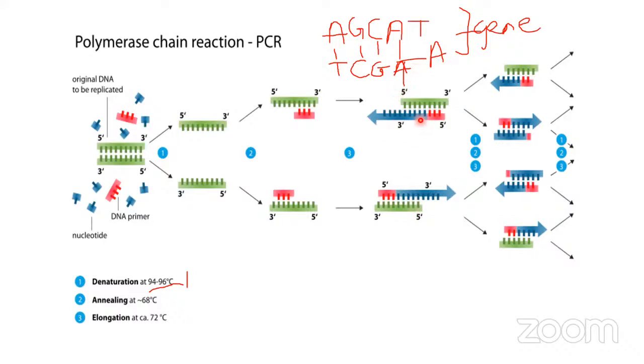And then after the elongation, our single-strand DNA here has become a double strand. So it can now start another reaction. And this one also forms another 2, this one forms another 2. So our 1 here has formed 2, our 2 here has formed 4. The moment we hit this one, it is going to give us 8. Any reaction? Any question?